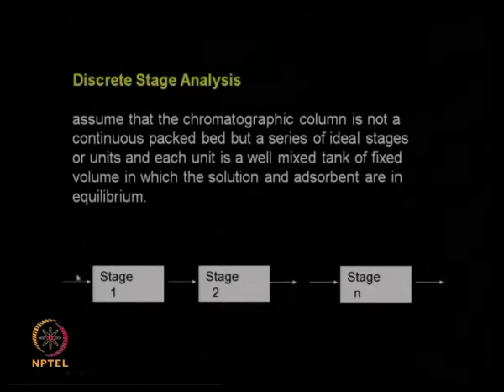So consider a chromatographic column as a stage process. We have the stationary phase in small stages, like an N-stage process. Now we have the mobile phase travelling from one direction to another. The solute gets adsorbed and desorbed based on whatever the principle is. It could be based on hydrophobic interactions, ionic interactions, or affinity interactions and so on. So we will try to model each one of the stages and extend it to the entire chromatography. That is what we are going to look at.